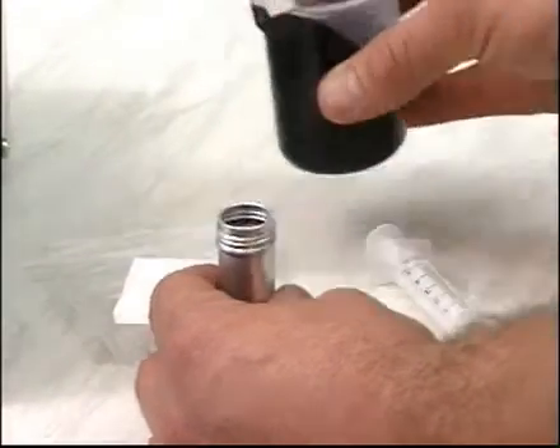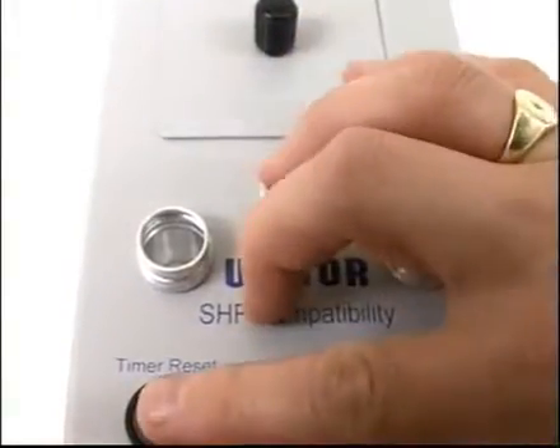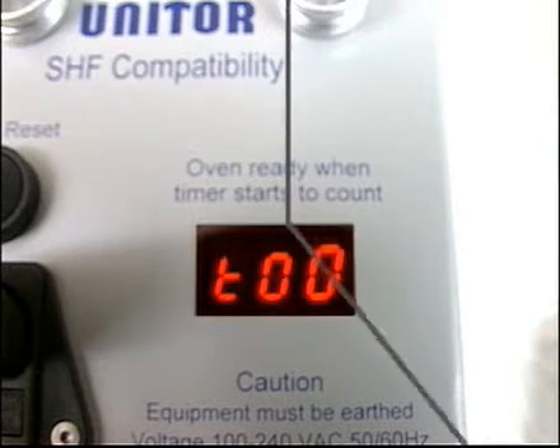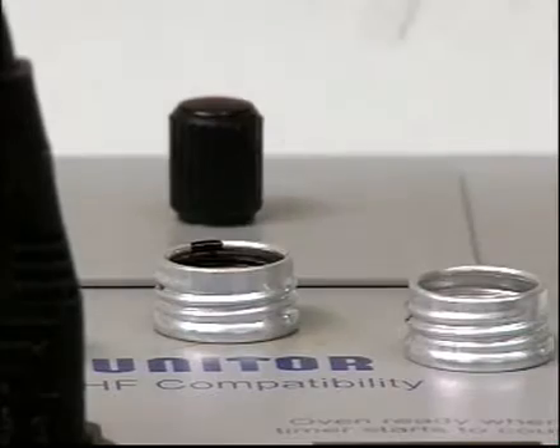The oil will fill to a height of around 30 millimeters. After the unit is fully heated to 100 degrees, place the tube in one of the preheat holes. Press reset, then wait for the timer to count to 20 minutes. Have some test paper ready.